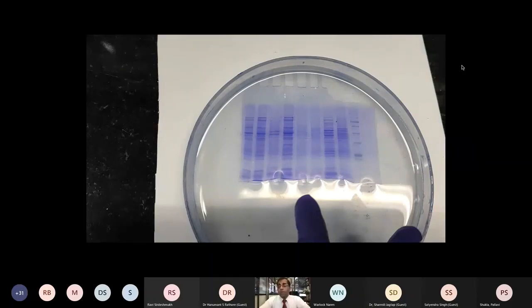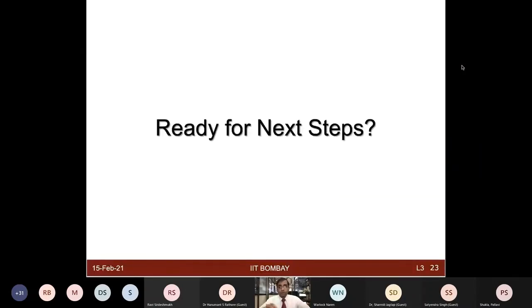So these are the things which look very simple, which every lab does. But I think when you are thinking about high throughput experiments and high-end instruments, before proceeding to those, we have to do a lot of work on this part to make our samples really good, to take to the next level of analysis for mass spec or other types of proteomics workflow.